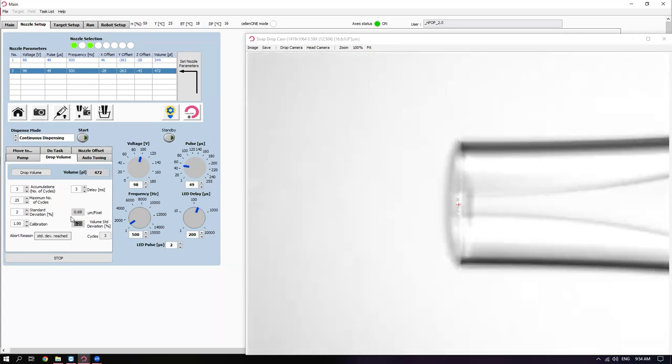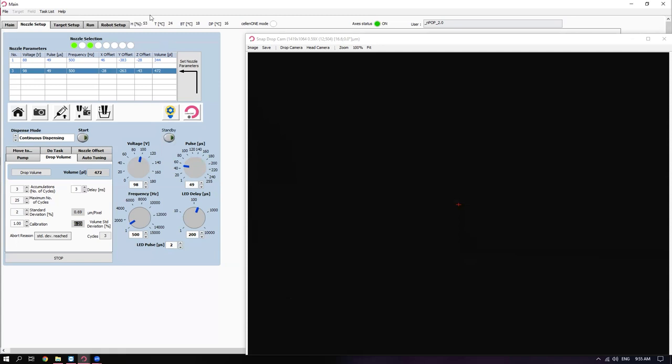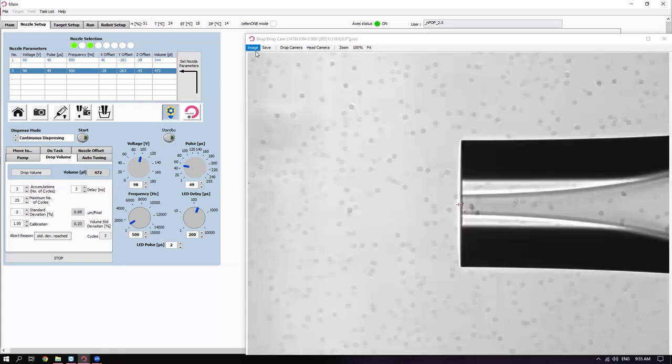Let's take a look. So we have this camera that's focused on the nozzle. And we can measure the opening of this orifice. It's around 73 microns in diameter. We have nozzles ranging up to about 85 microns in diameter. Those are really nice for very large cells. We did some work with Jenny Van Eyck's group in Cedars where we handle kind of 200 micron long cardiomyocyte.